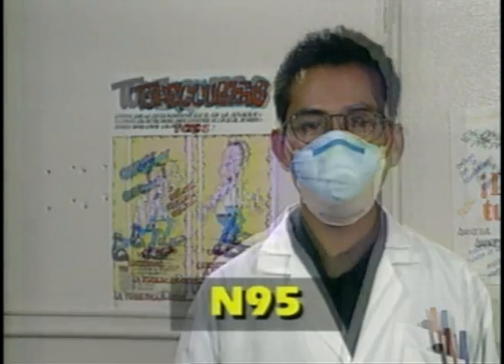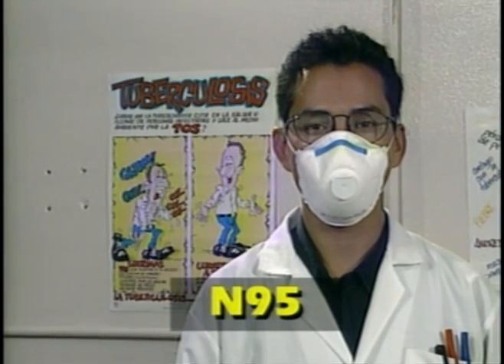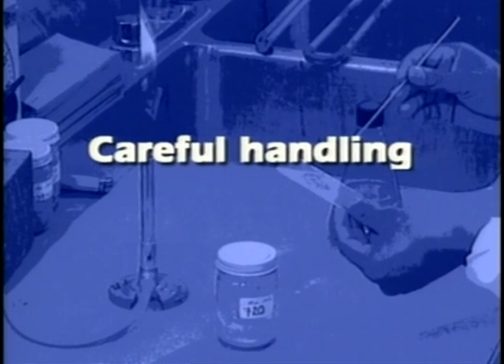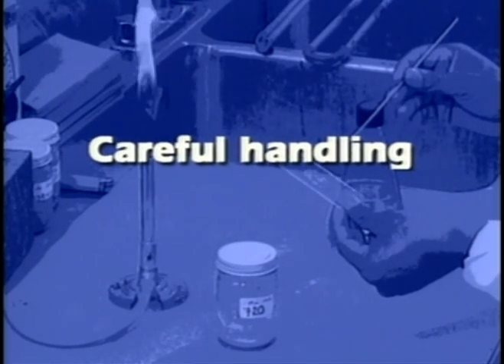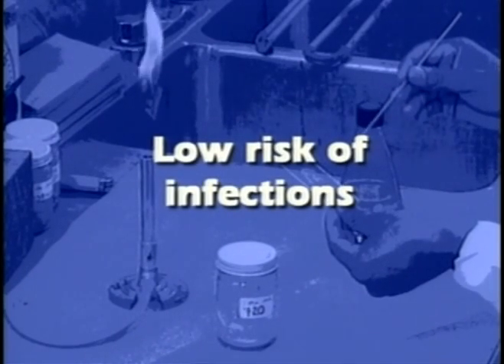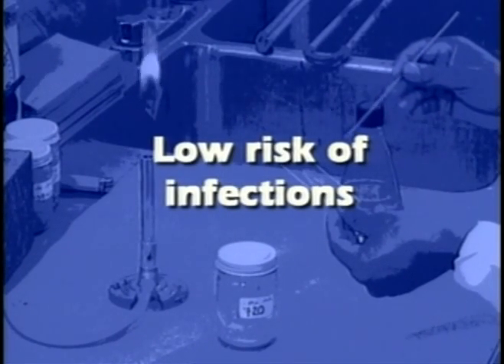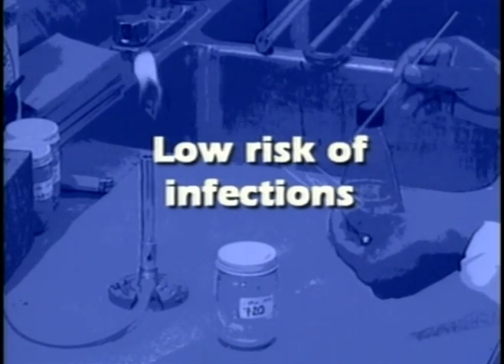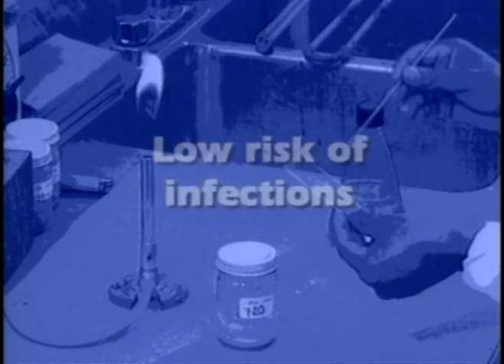Surgical masks do not protect against TB infection. Effective respiratory protection, such as an N95 respirator, is expensive and probably unnecessary if the technician uses appropriate technique. Careful handling during smear preparation should produce minimal aerosols. The low risk of infections during these procedures may not justify the cost of respirators and gloves where there may be limited resources for TB control.